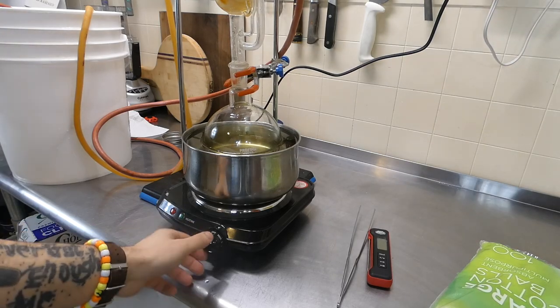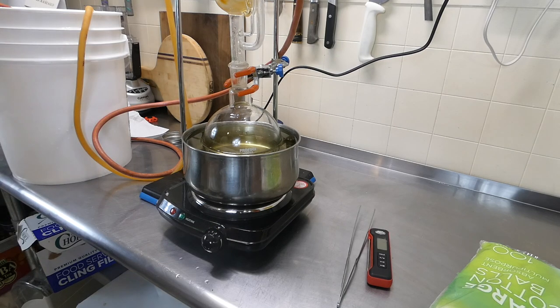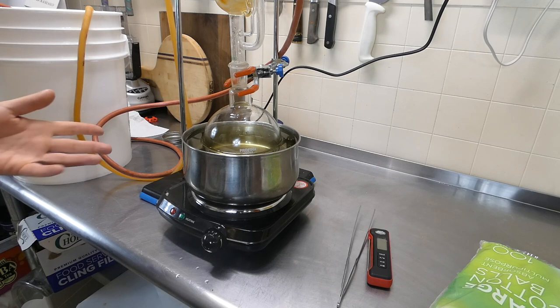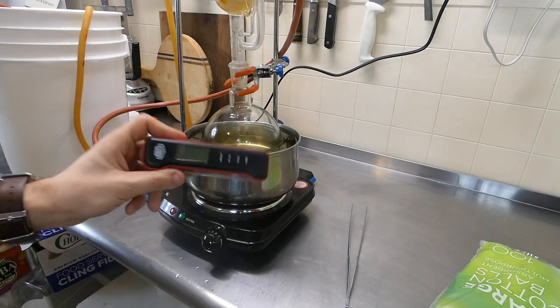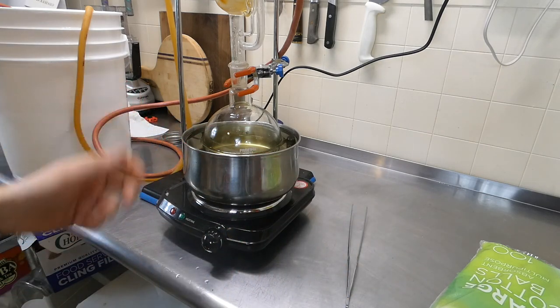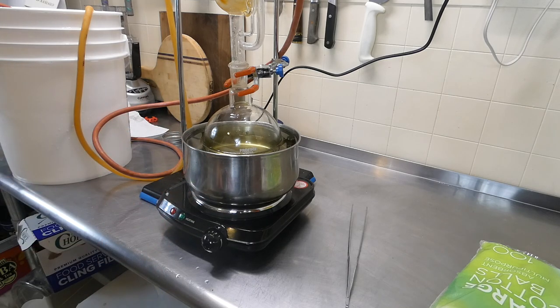All right, then we just turn on the heat source. We're gonna start low because ethanol boils at 173 degrees Fahrenheit or about 78 degrees Celsius. So every once in a while, we just want to get a little thermometer reading on it, see where it's at, and control the temperature then, because there's no reason for this to get any hotter than 173 degrees Fahrenheit.